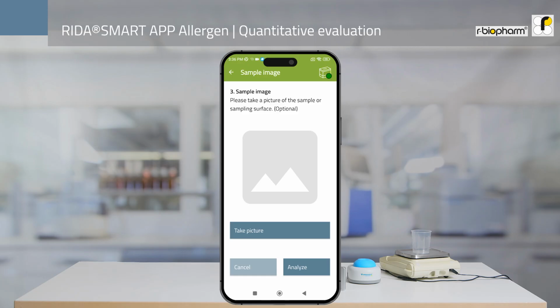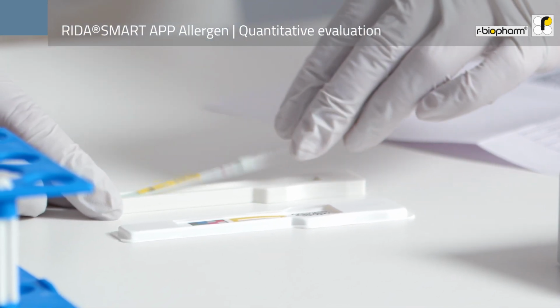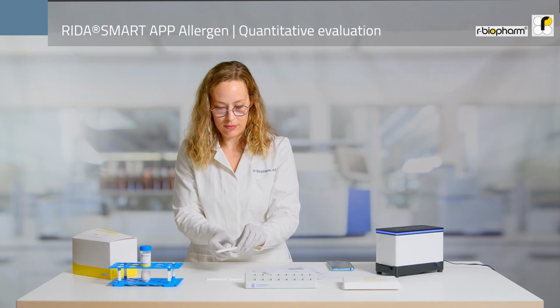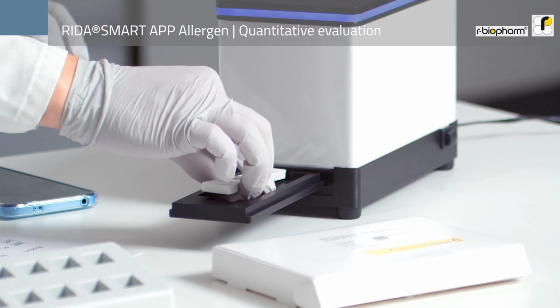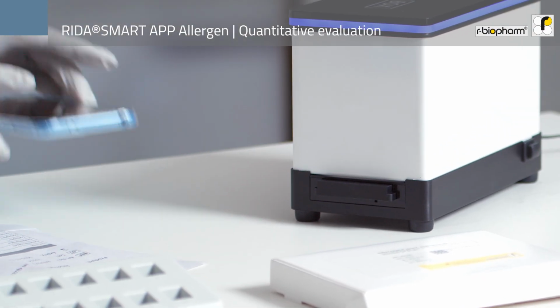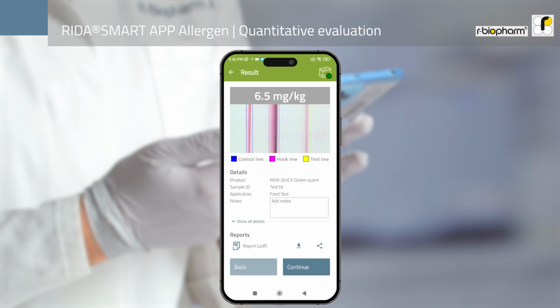In the next step, place the test strip into the test strip holder of the RIDA Quick Quant Evaluation Kit. The arrows on the strip should point toward the narrow end of the test strip holder. For evaluation with the RIDA Smart Box, insert the test strip together with the test strip holder into the drawer of the RIDA Smart Box and close it. Now start the measurement. The RIDA Smart Box takes a photo of the test strip. The data is then transmitted to the RIDA SMART App Allergen and is then evaluated.